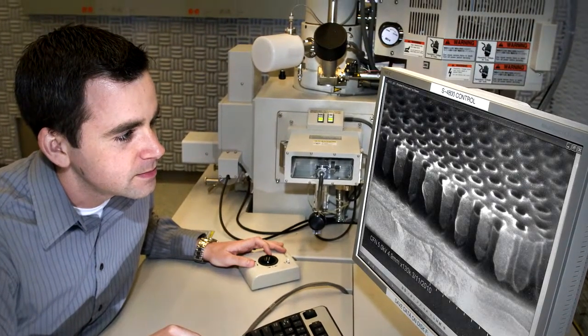CFN scientists use cutting-edge instruments to peer into nanoscale landscapes with unparalleled precision. Here's Eric Stack, leader of the Electron Microscopy Group, on these highly specialized techniques.